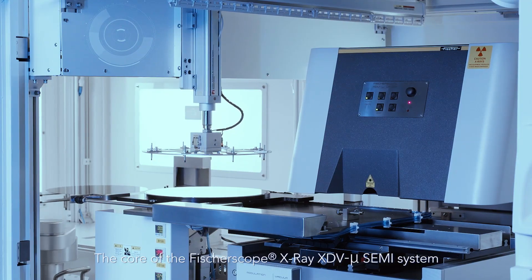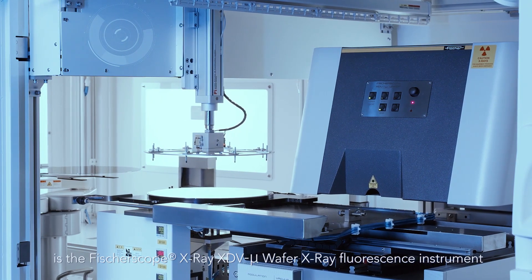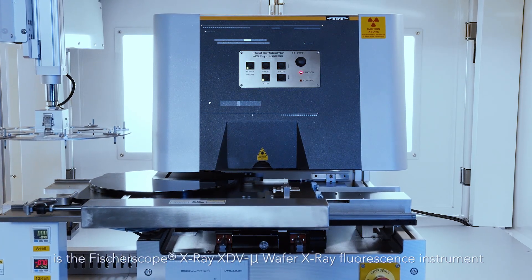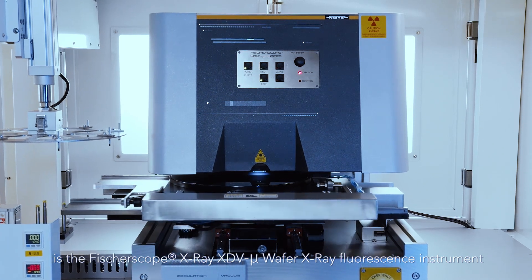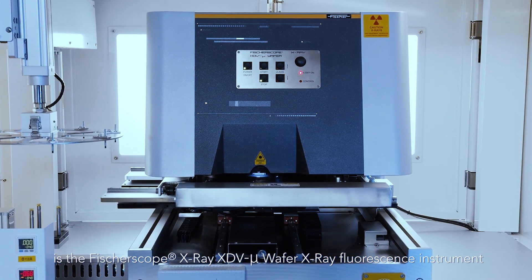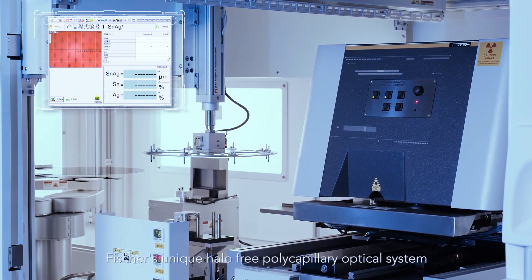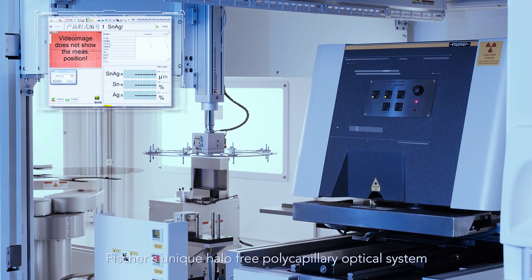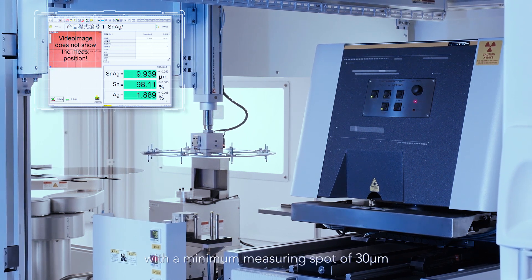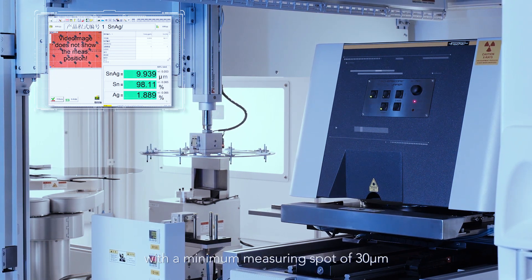The core of the Fischerscope X-ray XDV mu SEMI system is the Fischerscope X-ray XDV mu wafer X-ray fluorescence instrument. The key features of this instrument are Fischer's unique halo-free polycapillary optical system with a minimum measuring spot of 30 microns.